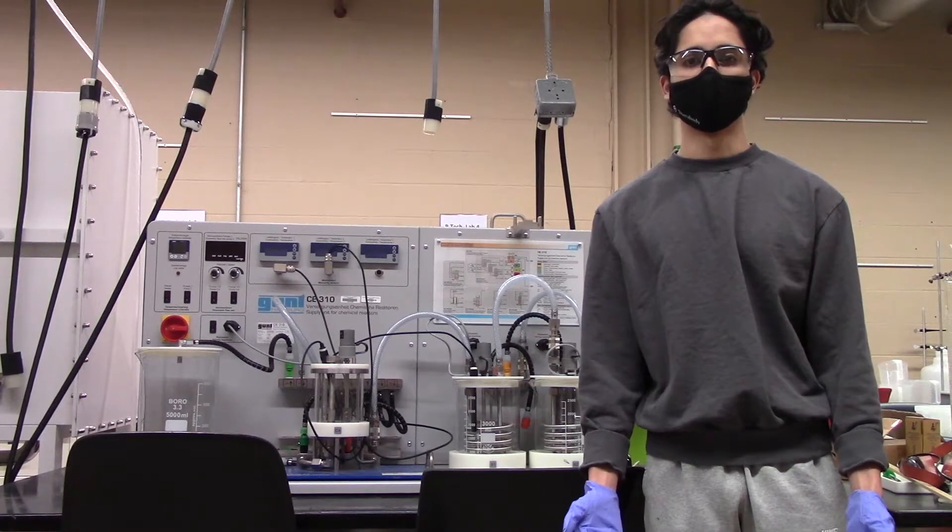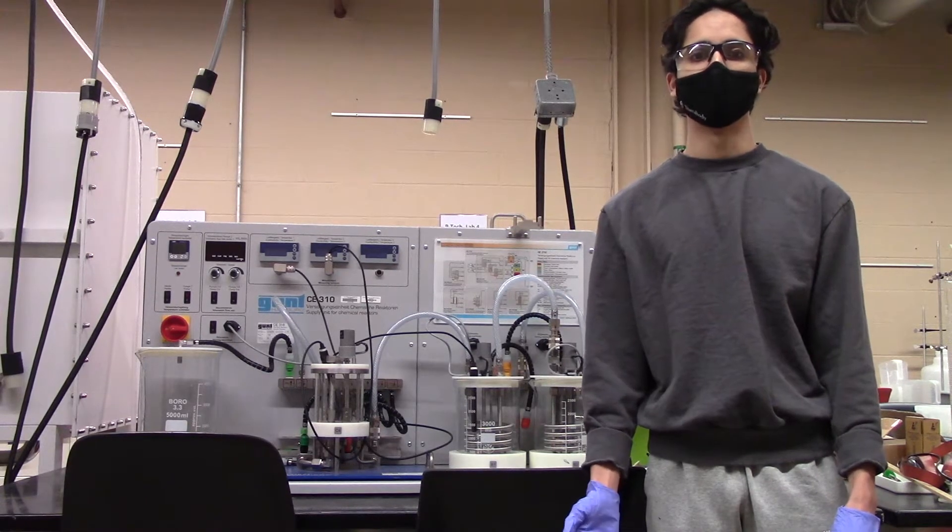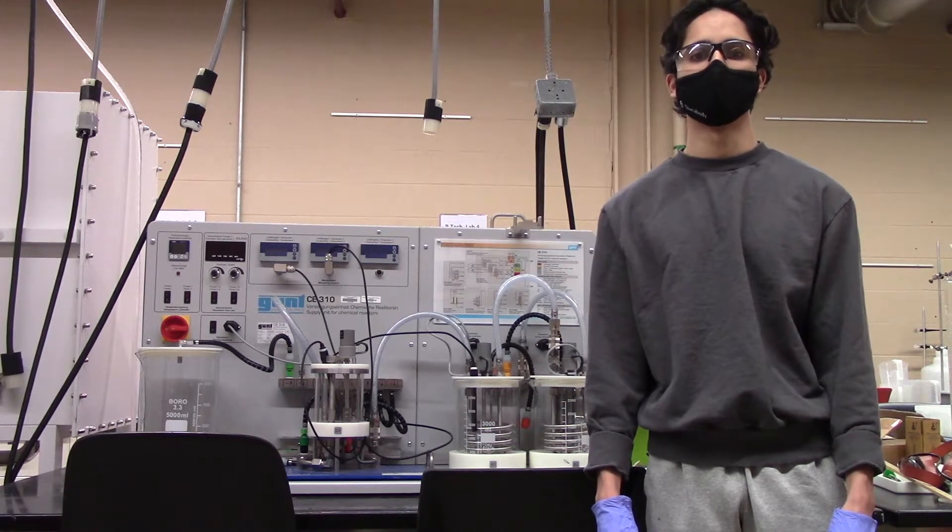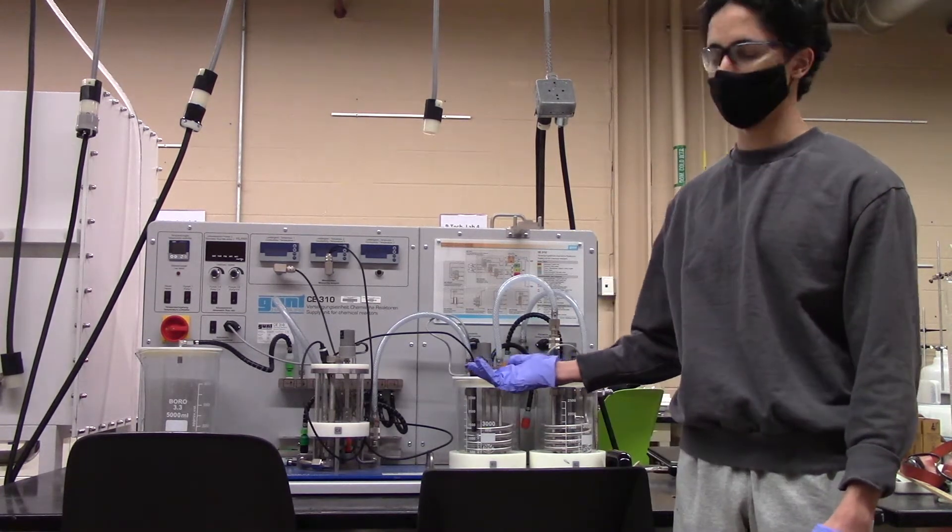The objective of the CSTR experiment is to determine the reaction rate constant of the saponification reaction between ethyl acetate and sodium hydroxide in a continuous stirred tank reactor.